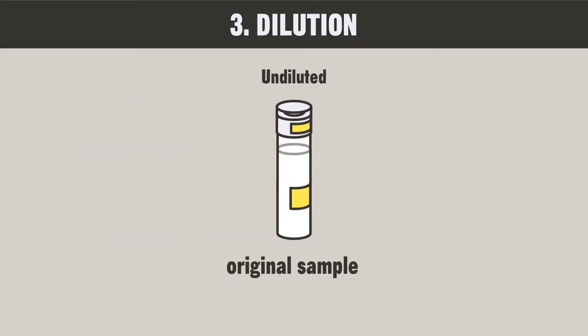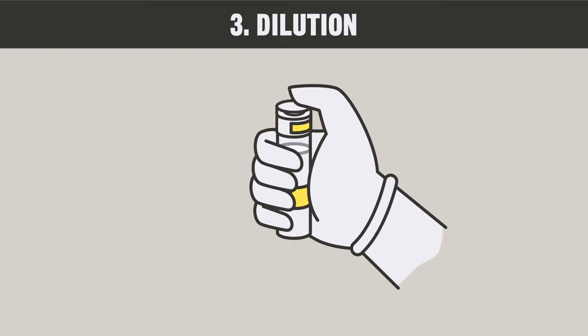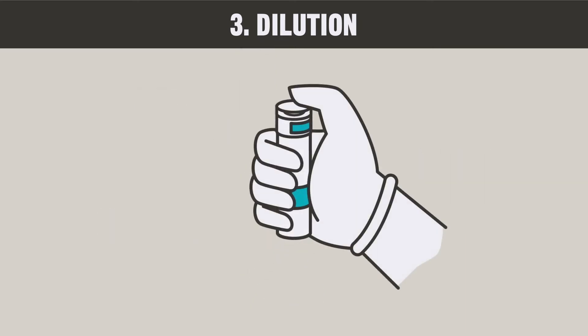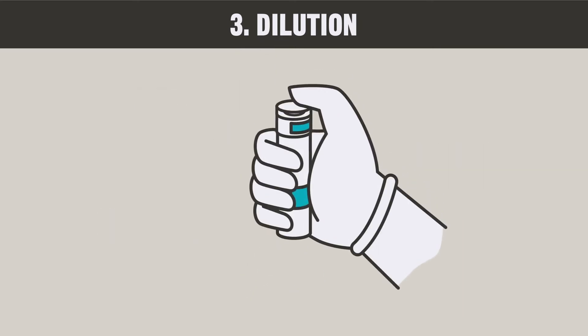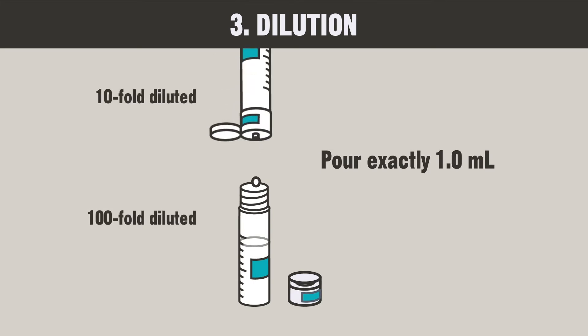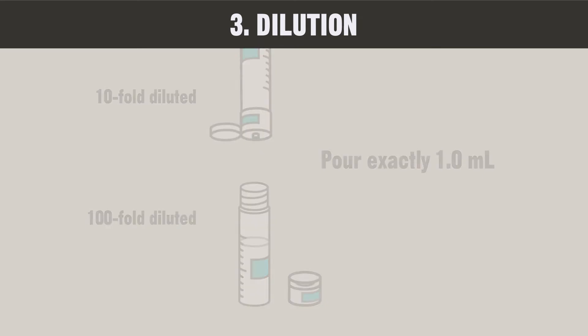The bottle with the original sample is the undiluted sample. First, shake the bottle well. Then, pour exactly 1 milliliter of the undiluted water sample into the 10-fold dilution bottle. This is your 10-fold diluted sample. Next, shake the bottle with the 10-fold diluted sample well, and pour exactly 1 milliliter of this sample into the 100-fold dilution bottle. This is your 100-fold diluted sample. Just before performing each dilution process, make sure that you shake the sample bottle very well so that the concentration of the sample is uniform.